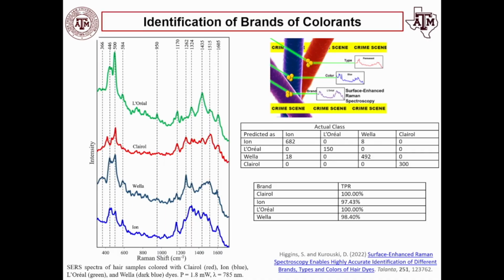What is also very interesting is that we can predict the manufacturer. And in our opinion, it's very important because every month manufacturers come with a new colorant, and every year. And of course, if we don't have this dye in our library, the question is how can we enable its identification?